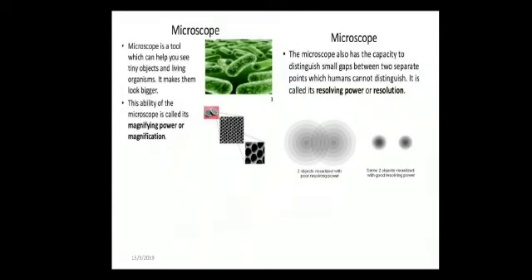Based on these principles, we have developed many microscopes in our engineering field to analyze material properties, material distributions, or the presence of voids. To analyze the various aspects of materials, we developed different types of microscopes.